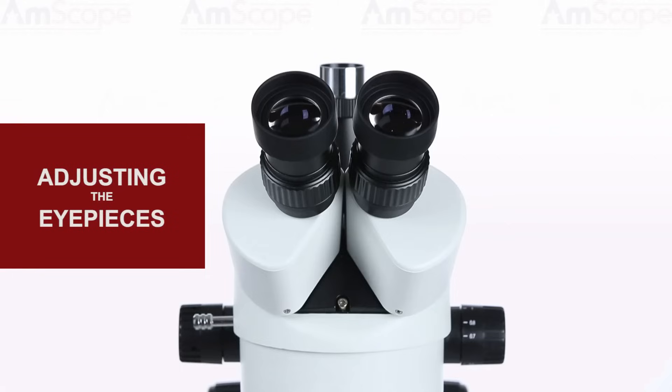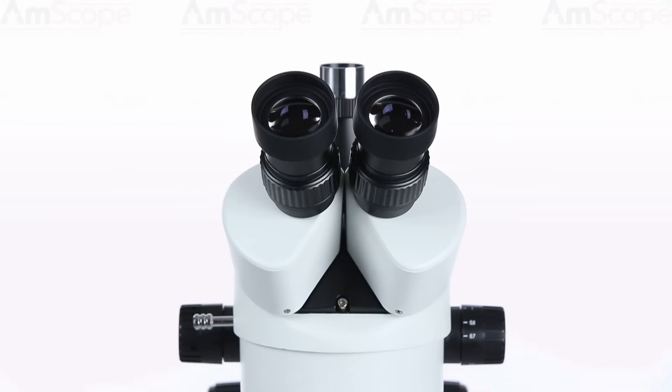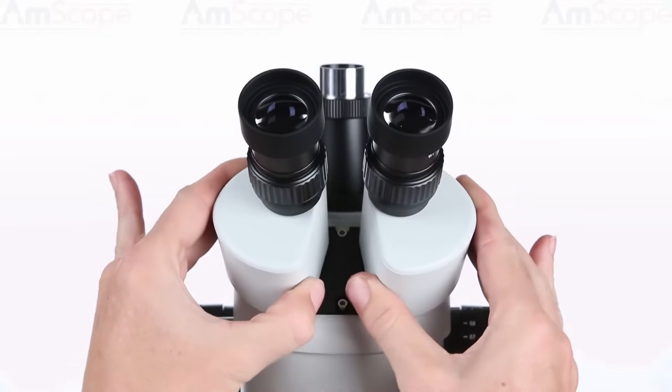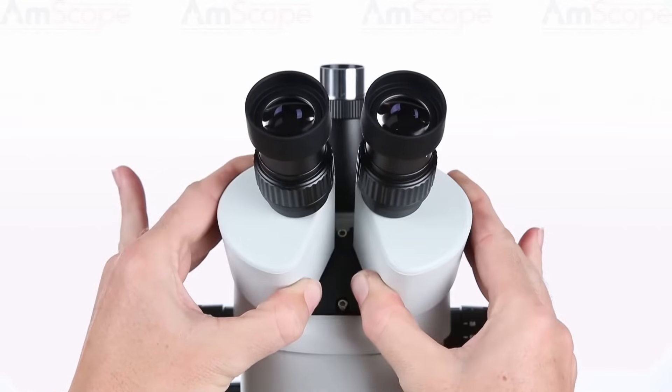To adjust the distance between the eyepieces, simply take hold of each interpupillary adjuster and gently pull them apart. While looking through the eyepieces, find a position that offers a comfortable field of view.